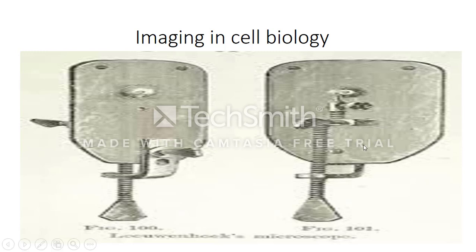It was very simple in method, and it simply was able to magnify to about 200 times. So that obviously opened the doors for many things. Individuals could see cells and things like that now. And it opened the pathway to figuring out better imaging technology for cell biology.